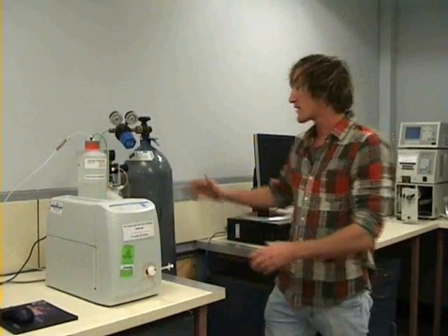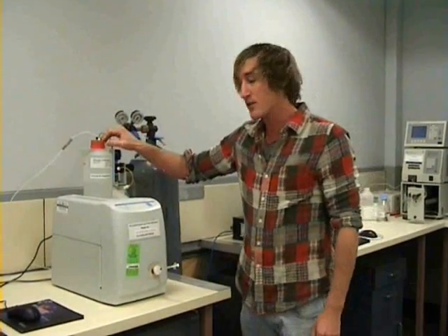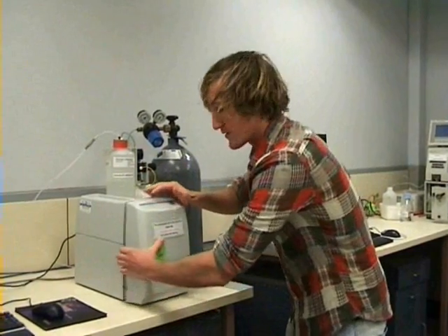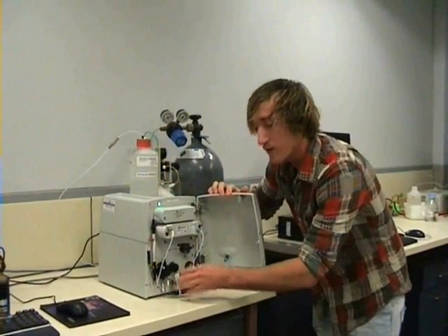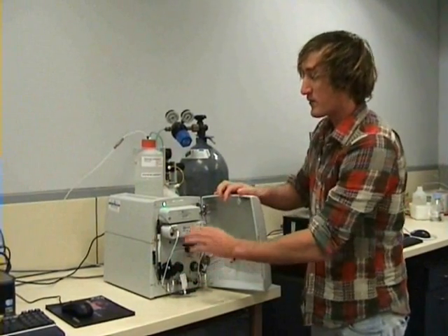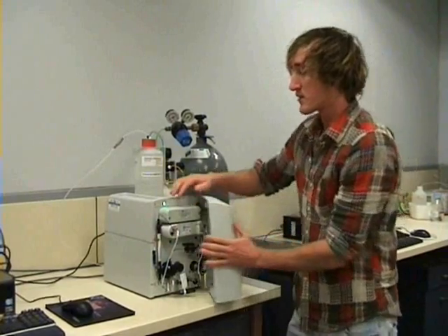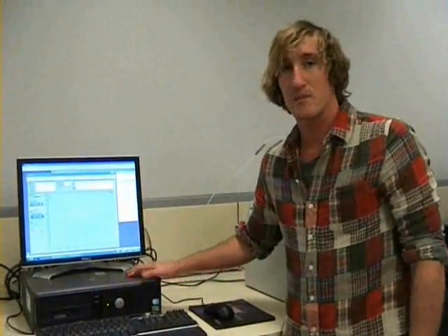The ion chromatograph system we're doing today uses gas pressure and runs through on a mobile phase of sodium carbonate and sodium bicarbonate. Our sample is injected through this port here, then moves on to the injection loop, passing through the ion chromatographic column, then on to a suppressor and then a detector, which converts our results into electrical signals picked up via our software and computing system.